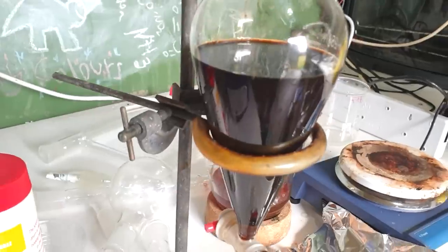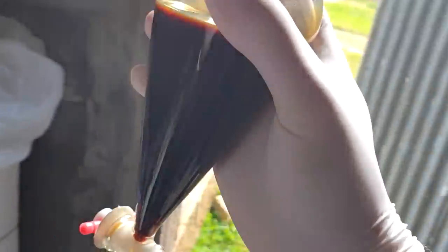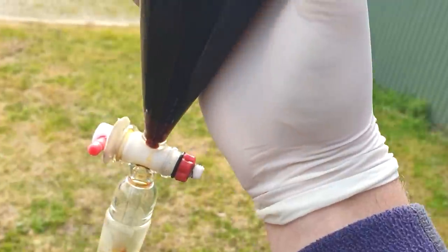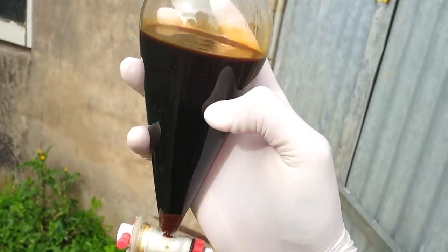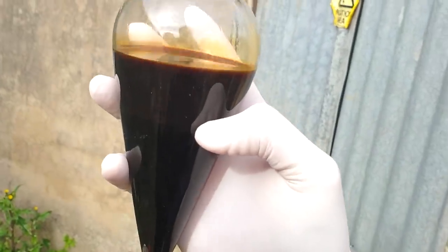The phase boundary I think is impossible to see in this lighting. We're going to have to go out in the direct sunlight, which I'm a little nervous about seeing as I dropped that cesium on the lawns. We're doing our best not to drop this on the lawn. There. I cannot see that on the phone screen at all, but maybe I can increase contrast. Thanks, editing Tom, for putting that in, and that's the line there. So we want this top layer here, and we get rid of the bottom layer there.